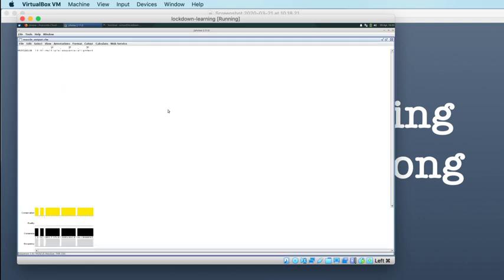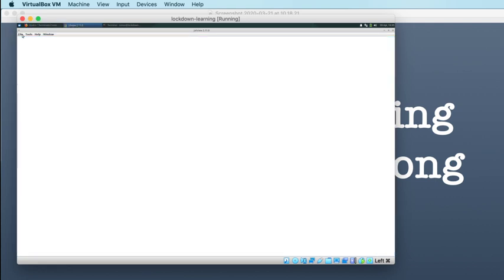Right, okay, so it has summarily failed to read our input for some reason that I don't entirely understand, but this is clearly not our alignment. So the first thing I'm going to do is close that alignment because that hasn't worked, and then I'm going to try again to input an alignment from file.